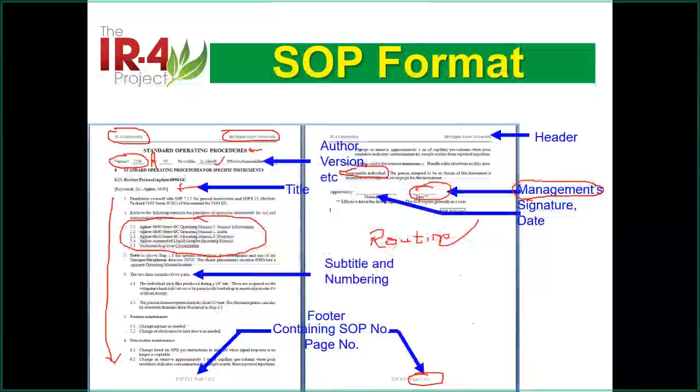So if you do not use all the manual, you probably need to simply get certain pages, copy, and put it here in the details. That's better practice rather than referring to the manuals or to some papers or references. So it's your decision what you need to do. As long as you keep those manuals as an attachment with this SOP, you are fine. But we wrote this way a long time ago. From now on, we typically just write the details there, make this SOP like 3 pages, 4 pages, rather than you just archive another book so thick with your SOP. So that's our practice.